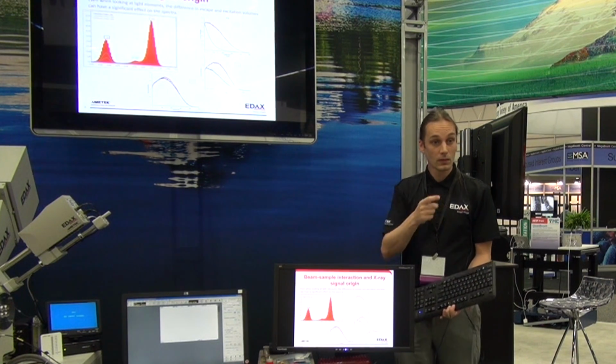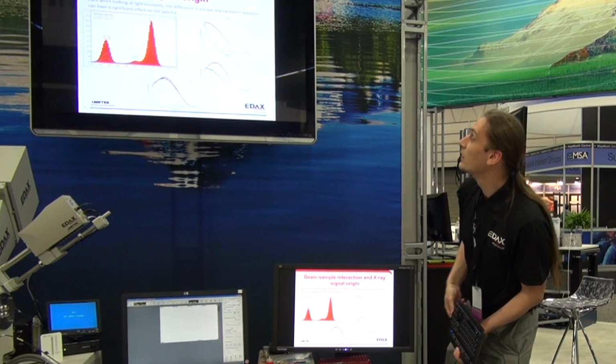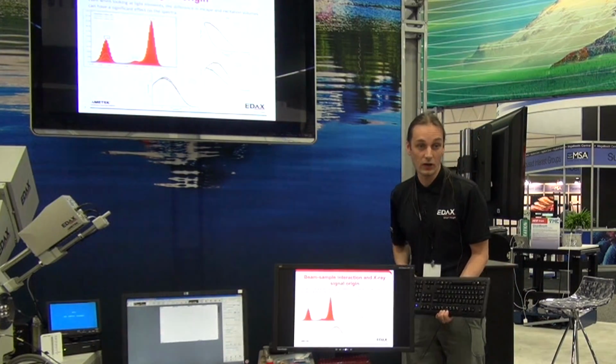Is that generated in the Casino software? Yes, this is also simulated in the Casino software.